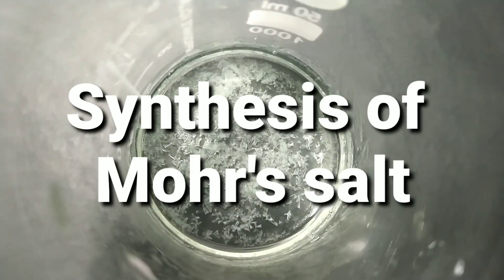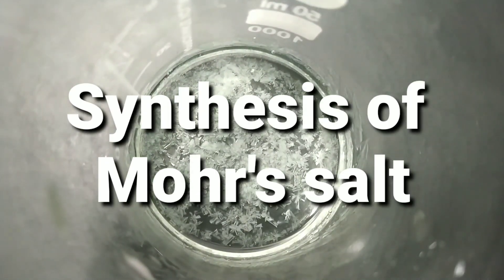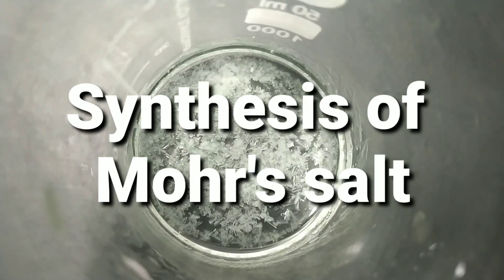Hello friends, today we will be synthesizing the double salt ferrous ammonium sulfate, or ammonium iron sulfate, better known as Mohr salt.